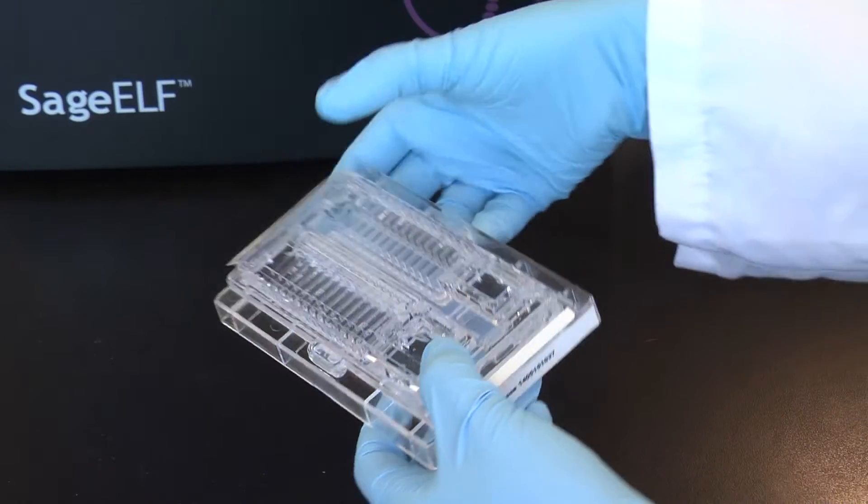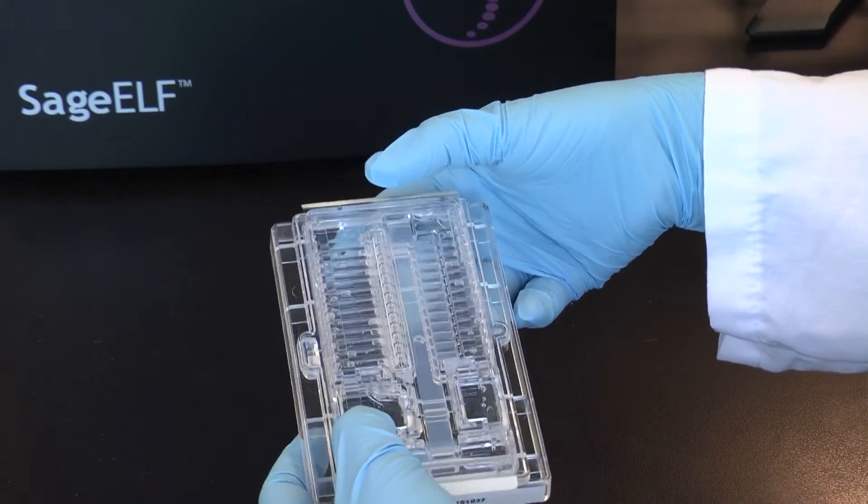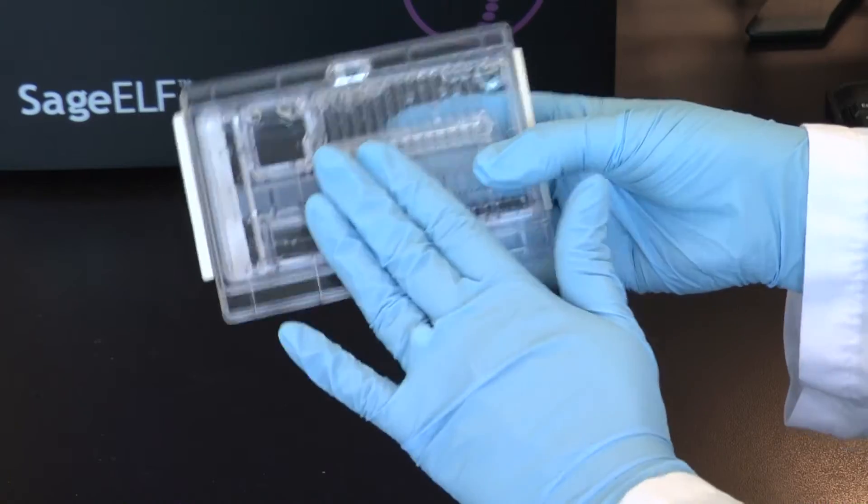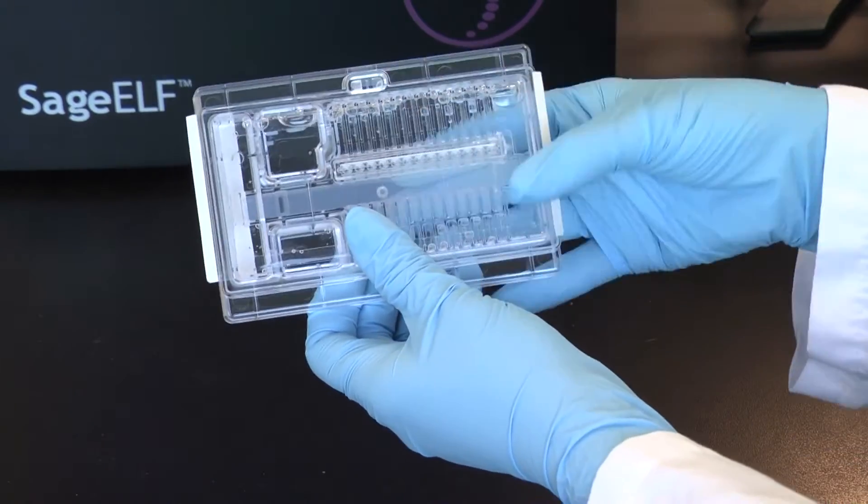Make sure there are no bubbles beneath the end of the separation gel column. Continue to rotate the cassette, and then tap to remove bubbles from behind the elution wells.